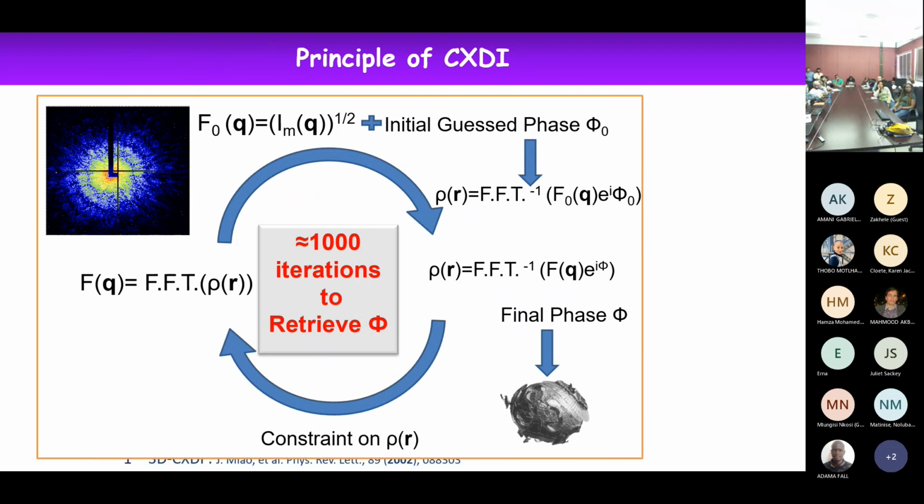What do we get in this case? Well, we get a 2D pattern, and this pattern contains what we call the speckle. So you can see that there are small grains in this scattering pattern, and the speckle is related to the fact that the system is not homogeneous. It's not a full sphere or full particle, but there are some holes inside, and this is creating the speckle.